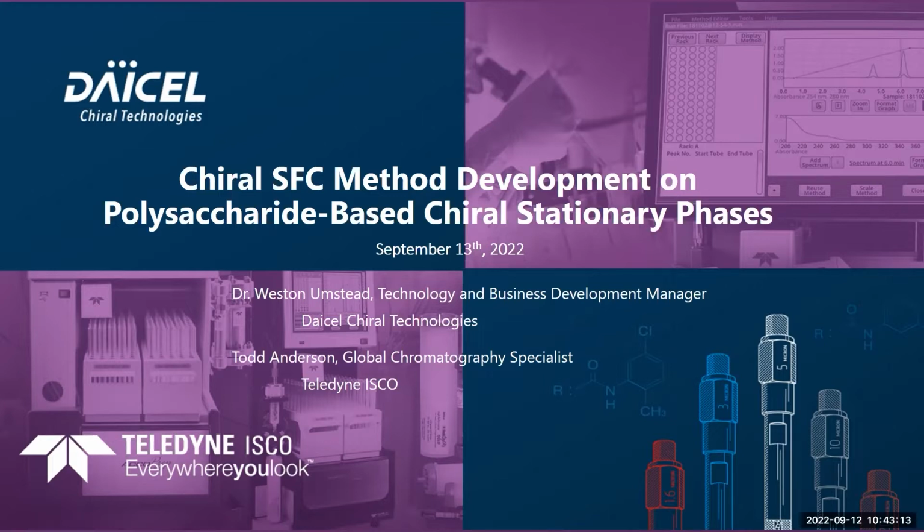Thank you, Todd, for the introduction. As you are all very much well aware at this point, you are here to learn a little bit about chiral SFC method development on polysaccharide-based chiral stationary phases.